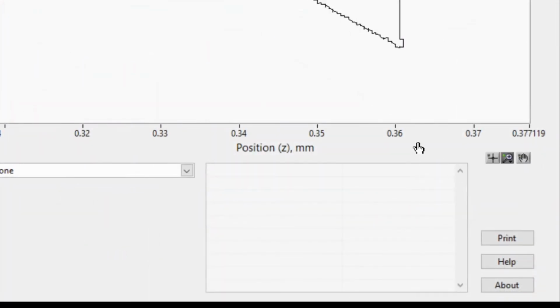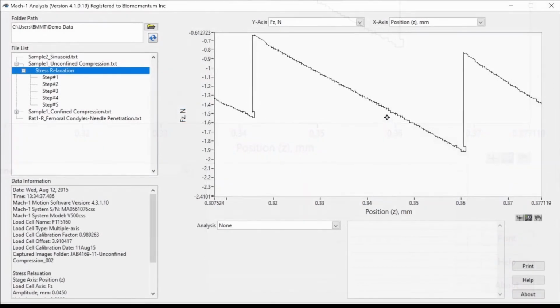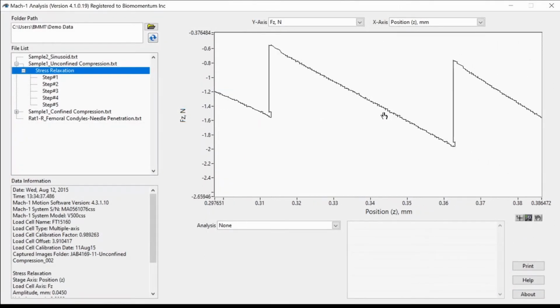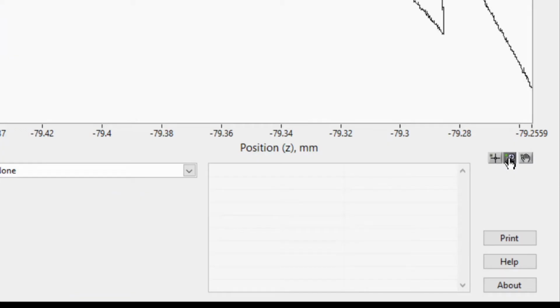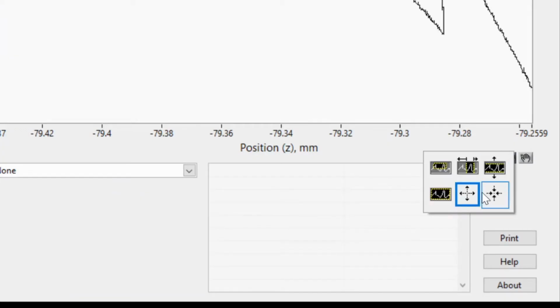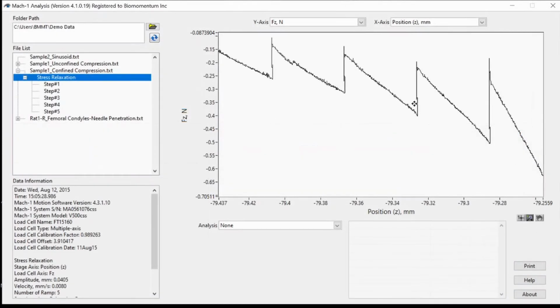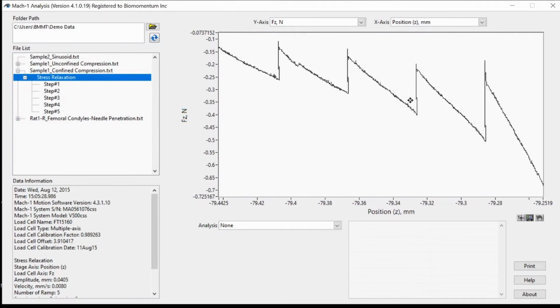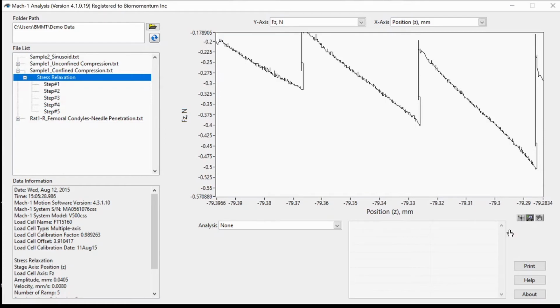Zoom in about a point. With this option, click a point you want to zoom in on. Press and hold the Shift key to switch between zoom in about a point and zoom out about a point. Zoom out about a point. With this option, click a point you want to zoom out from. Press and hold the Shift key to switch between zoom in about a point and zoom out about a point.